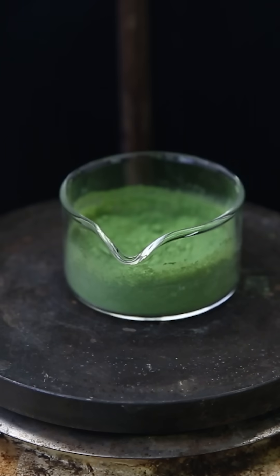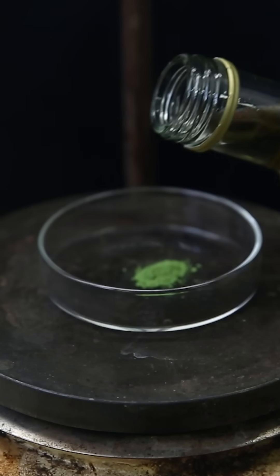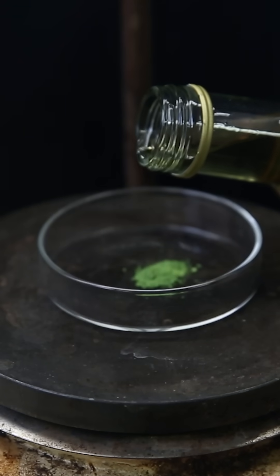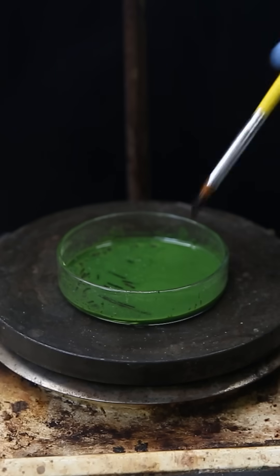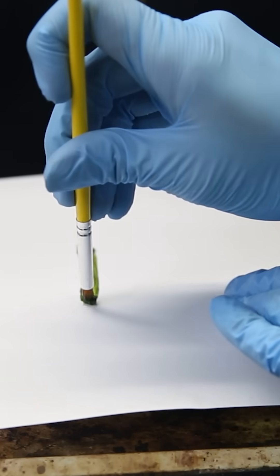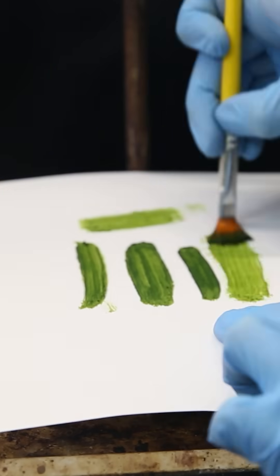This powder can be used to make various types of green paint, traditionally using some kind of oil like walnut oil. However, it has to be very finely powdered for optimal results. After mixing it with walnut oil, I can use it to paint on some paper, giving a very natural green color.